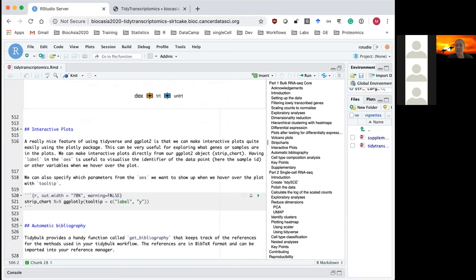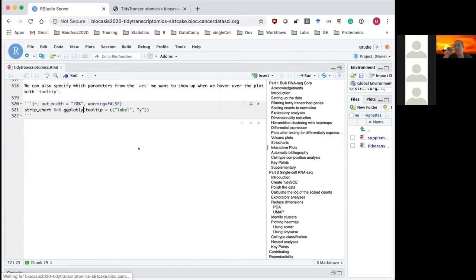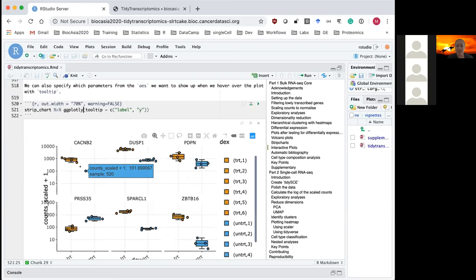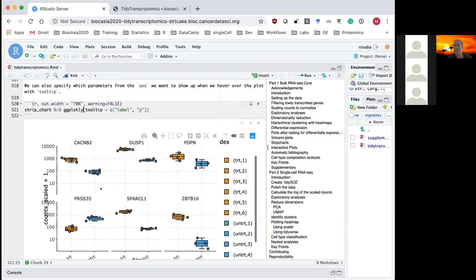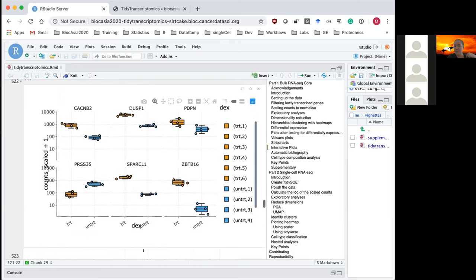Because all plots use ggplot style, they interact nicely with the plotly ggplotly function, so we can make any of these plots interactive. For example, the interactive strip chart lets us see which sample each point belongs to. Similarly we could make an interactive volcano plot or any of the other ggplots, simply by adding a pipe to ggplotly.